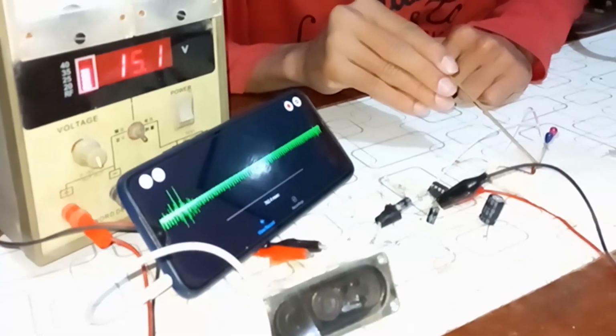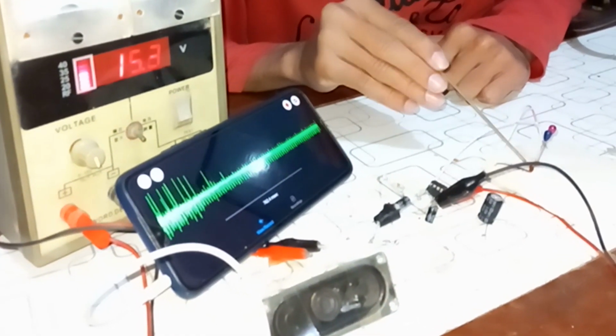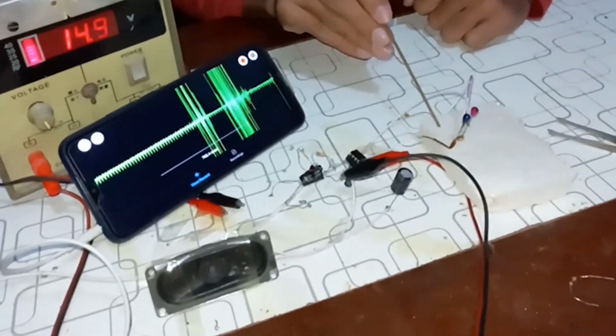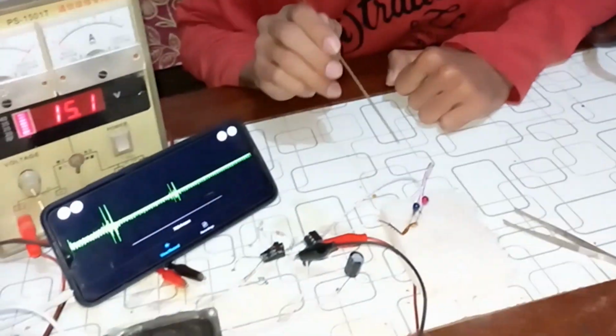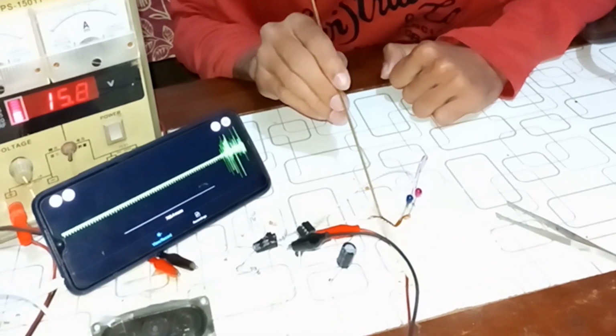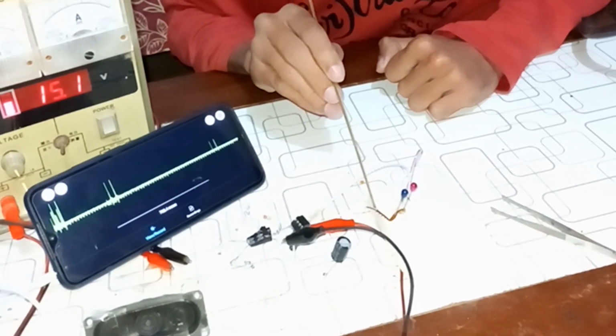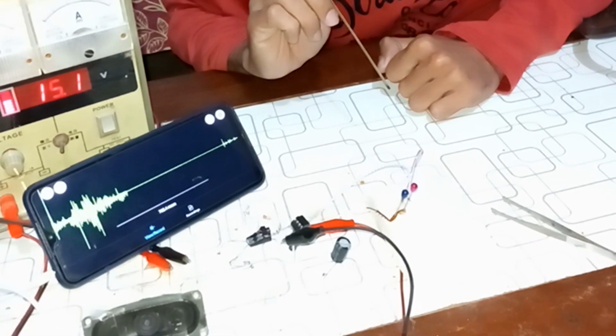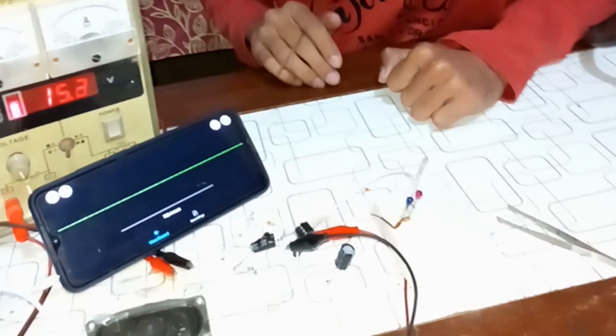Have you noticed the rate of popping and spontaneous discharge rate increases when I touch the leg? It is actually the spontaneous discharge rate of the living neurons when I touch the leg. They become active and they produce specific signals.